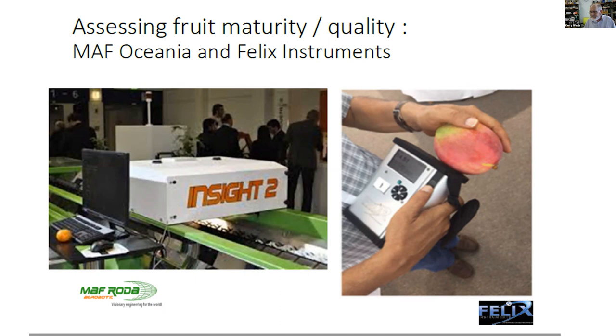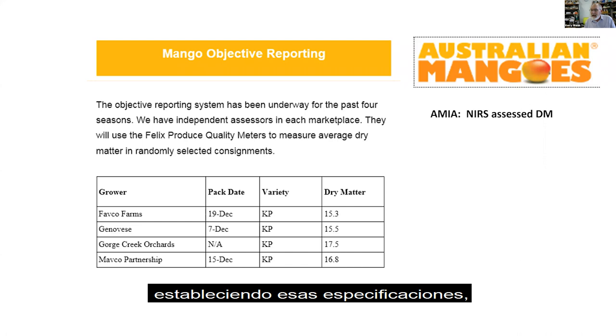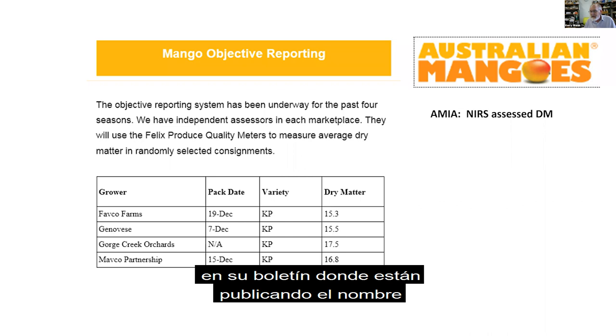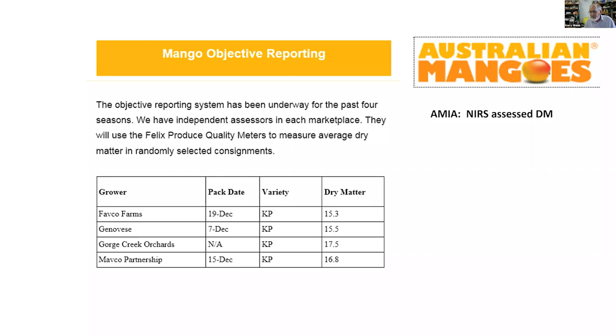Stepping on to the next slide, that was just backing up that statement. This is the Australian Mango Industry Association having set those specifications, and they have independent assessors in the marketplace using the meters to check average dry matter in randomly selected consignments. So this is just a little snip coming out of their newsletter where they're publishing the name of the grower and the dry matter content as a way of making people up their game in terms of not harvesting too early. Yes, moving on.